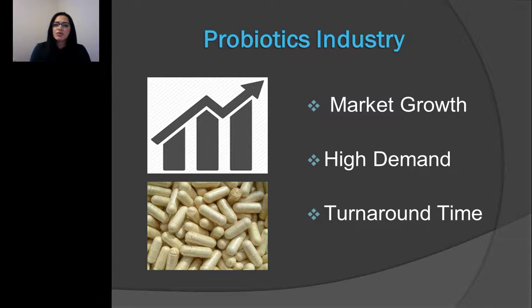Usually, when we do the viability determination for these products or the raw materials, we have to plate these samples, and then it takes about 3 days. So we're talking about a time-consuming method, and that doesn't allow the manufacturer or the vendor to release the products in a timely manner as they desire.